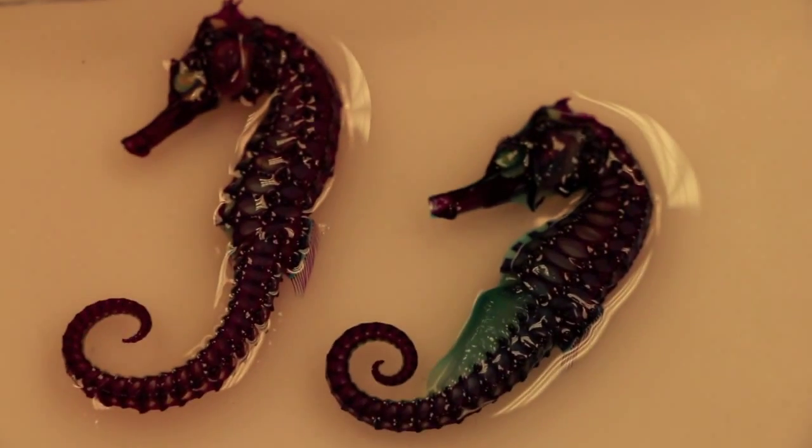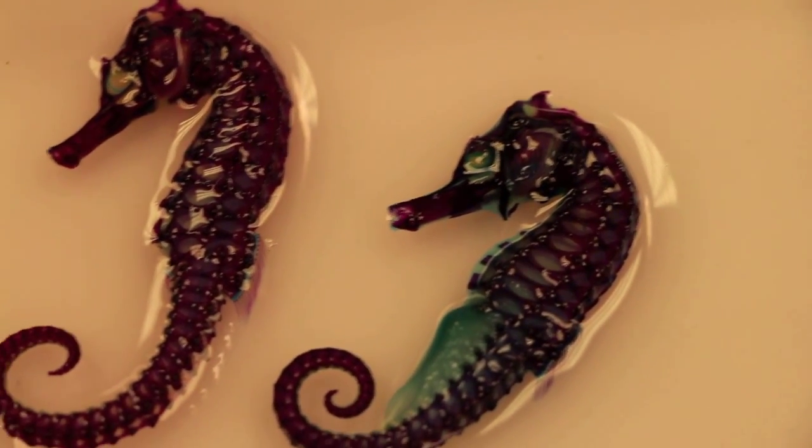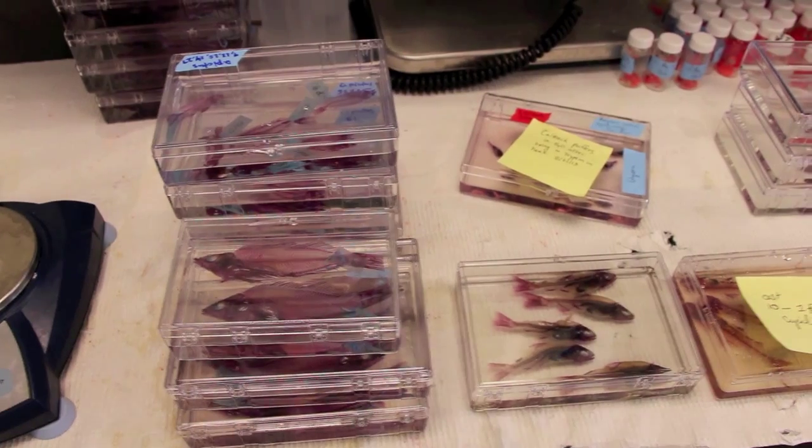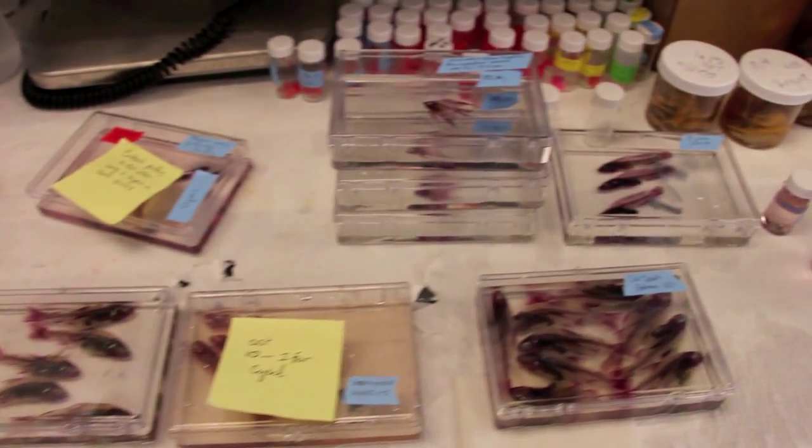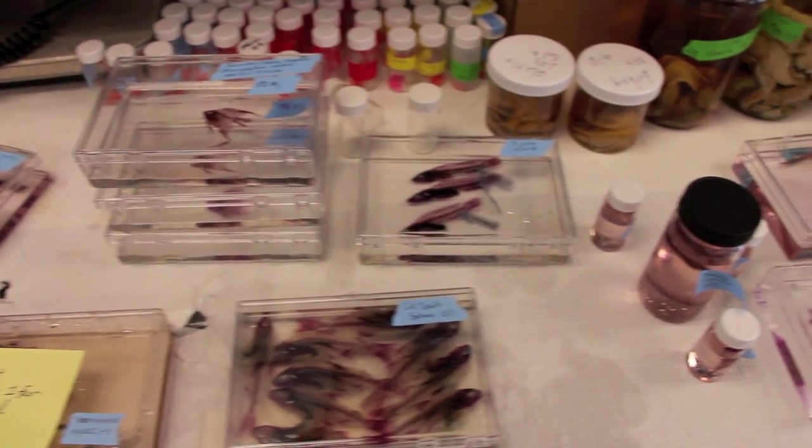Here in Elver Lab, we choose to clear and stain most of our specimens. We do this for a variety of reasons. The first of which is that the specimens become pliable again. And also, the muscles are still intact, so we can see how those attach to the skeleton.